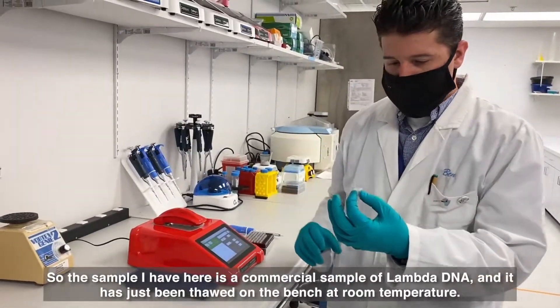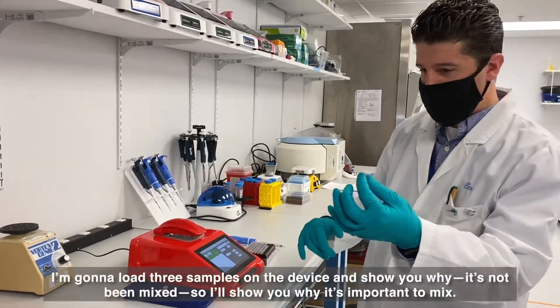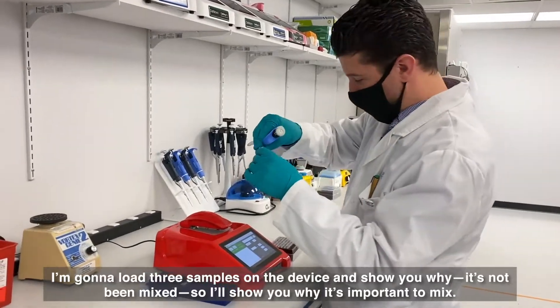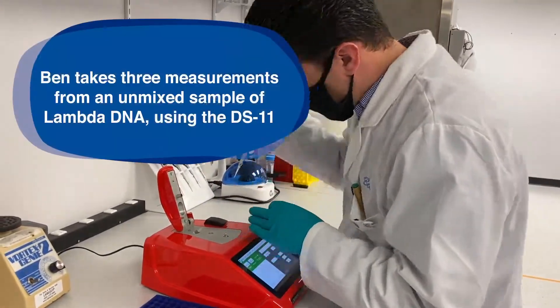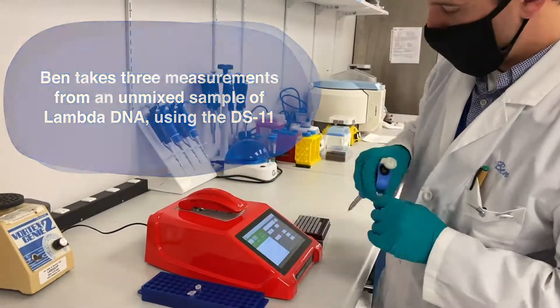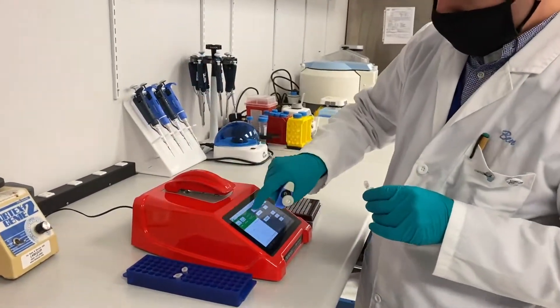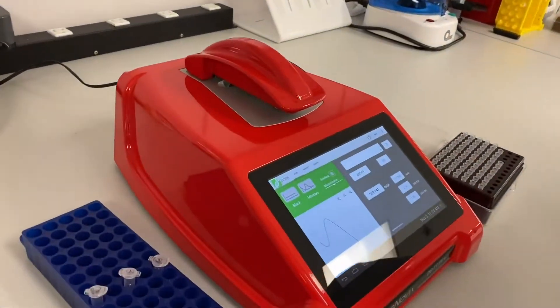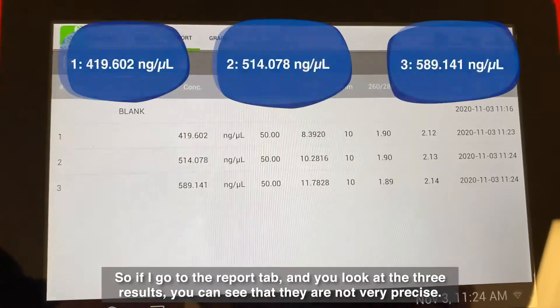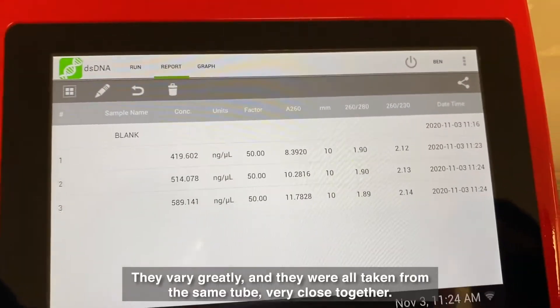The sample I have here is a commercial sample of lambda DNA, and it has just been thawed on the bench at room temperature. I'm going to load three samples on the device to show why mixing is important. If I go to the report tab and look at the three results, you can see that they are not very precise — they vary greatly — and they were all taken from the same tube very close together.